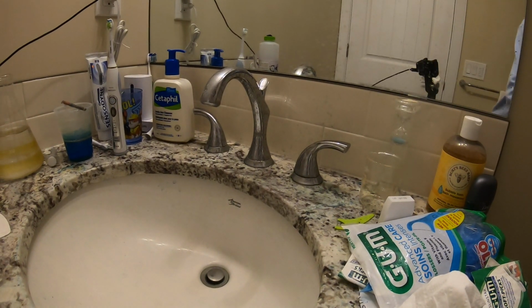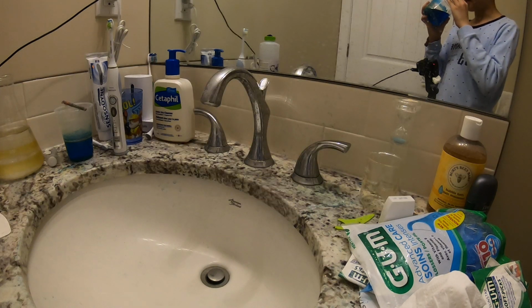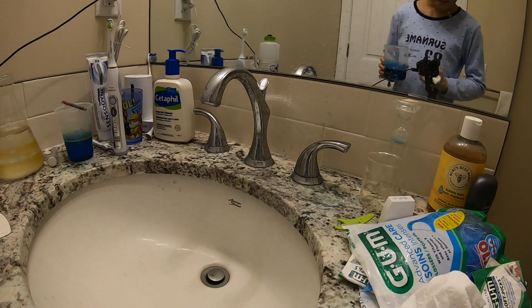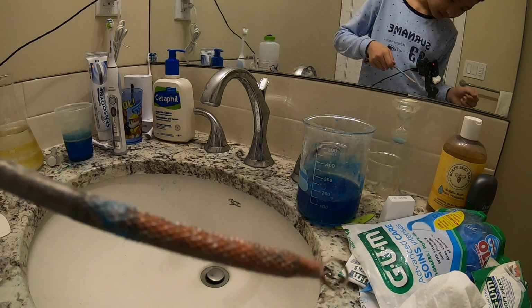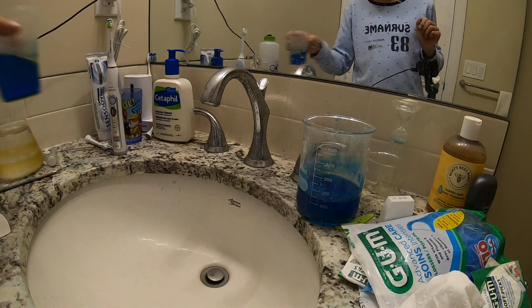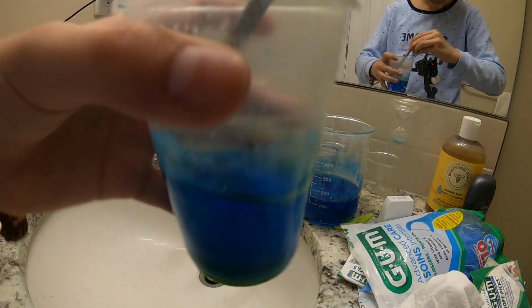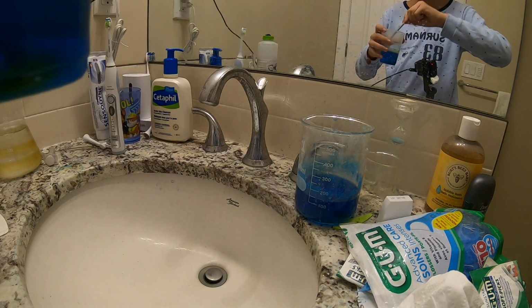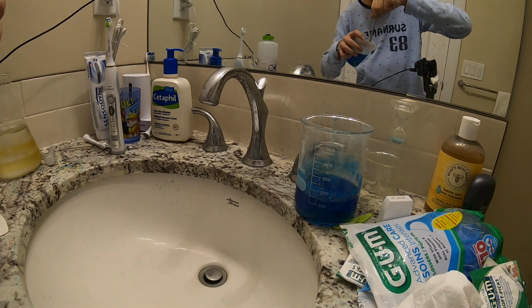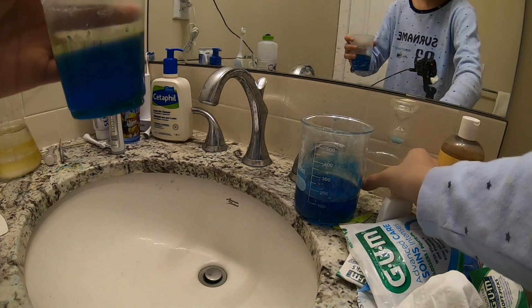So, I'm going to bring out the copper sulfate, and it has got dirt and everything on the bottom, and that doesn't make me happy. So, let me throw this aside. And you see some of the iron on this has been dissolved, so that's not too good, is it? So, let me get the excess on the sides to go in. Like I said, I don't like to waste copper sulfate because this stuff is not remotely cheap, you know what I mean? So let me throw that aside.